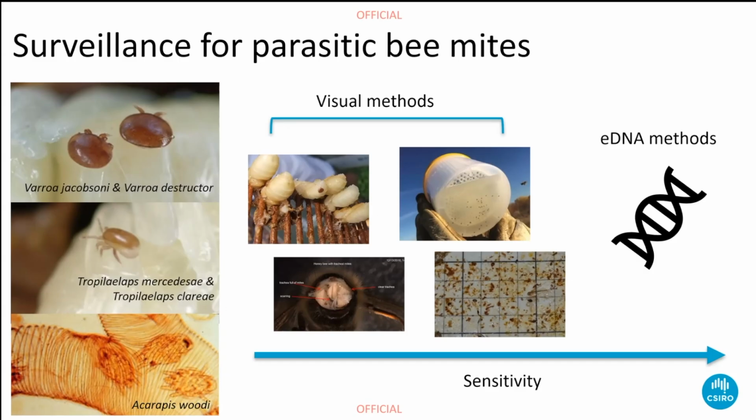So when we're looking for mites, while we do have a number of methods available, I think there's a real opportunity to be using eDNA methods in the mix as a complementary tool and try and have something that's potentially more efficient and a more sensitive approach.